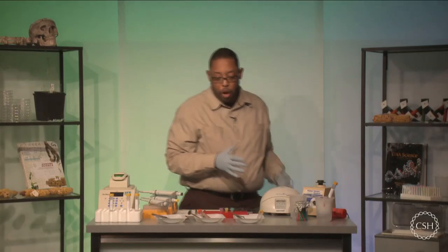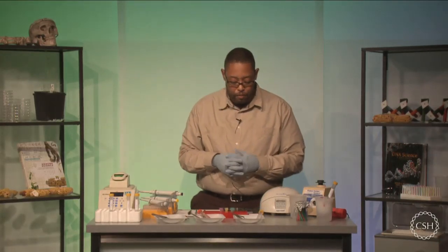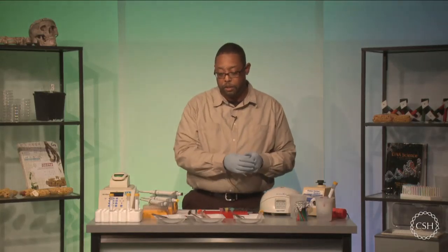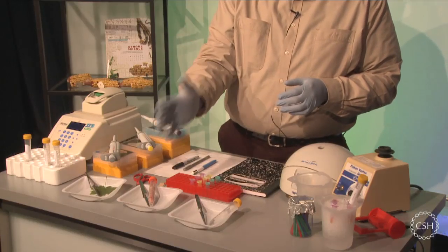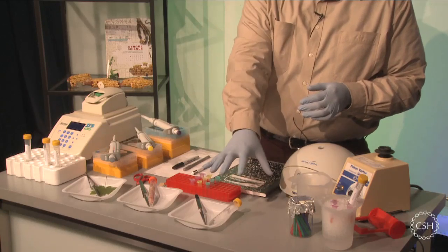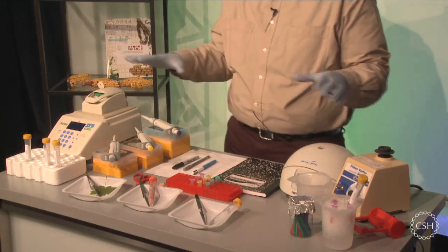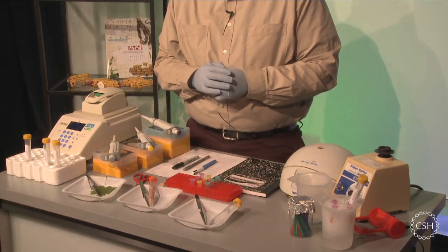All right, so let's talk about everything that you're going to physically need here. First things first, you're going to need some samples. So I have 3 sets of samples here, and I have some plants, some sort of meat. This is pork actually, and I have an insect here, which is actually going to be my house cricket. I'll pull these out in just a second, but we still have numerous other things to physically go through here.